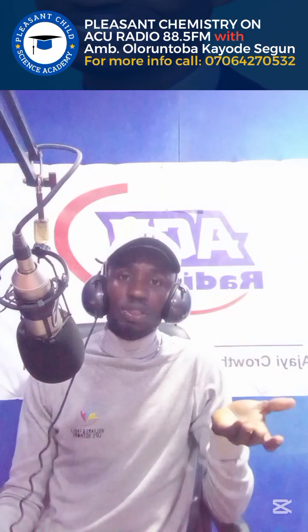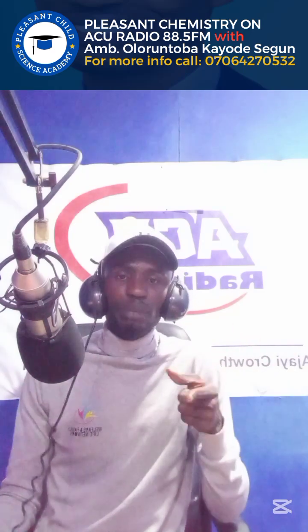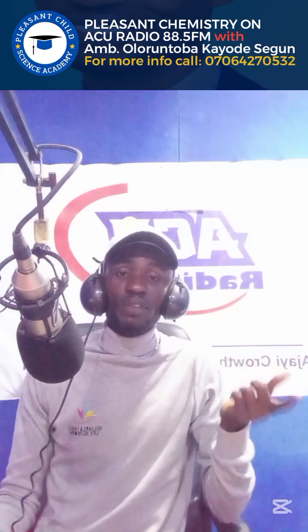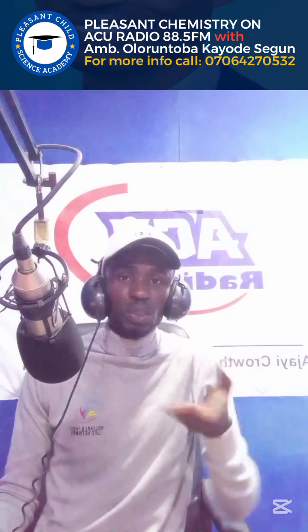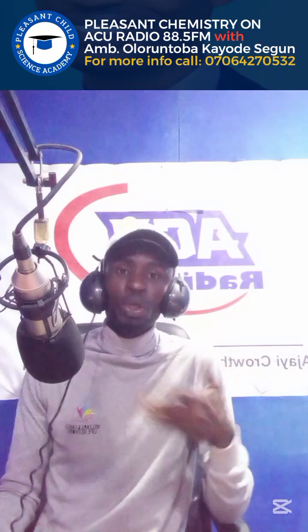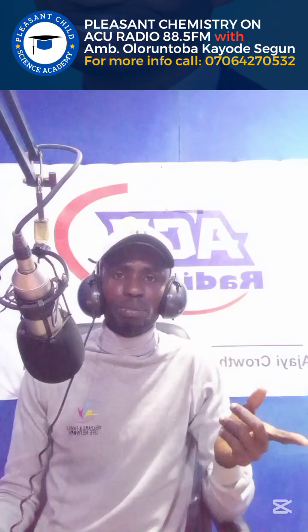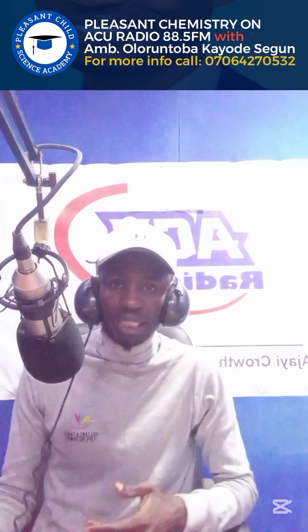Ca is the concentration in mole per dm cube of acid, and Cb is the concentration in mole per dm cube of base. Ca is that for acid, and Cb is that for base. Va is the volume of acid used, which is your titre value, and Vb is the volume of base. Most of the time it's always 25.0 centimeter cube. And Na over Nb: what is Na? Na is the mole ratio of the acid, and Nb is the mole ratio of the base.